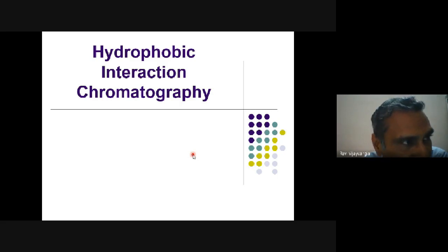Okay, biotin is a smaller molecule, so a biotin-streptavidin kind of affinity can be created. But again, it is difficult because tagging specifically to one molecule is going to be difficult. I have not focused on that line because we work only on proteins. But that is a good question. Small molecules like biotin can potentially be used instead of a peptide tag.